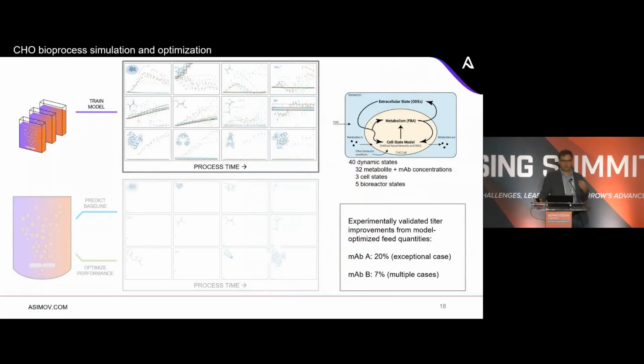So in one particular instantiation, I'm going to focus on the hybrid instantiation of our CHO simulator here. It's composed at its core of a metabolic flux analysis or a flux balance analysis, which represents the cell metabolic network. And it makes an assumption that the cell doesn't accumulate anything as part of its metabolism, right? So basically mass is conserved within the cell. But in typical situations, this would be combined with a set of ordinary differential equations that represent mass balance extracellularly, and we would call that dynamic flux balance analysis.